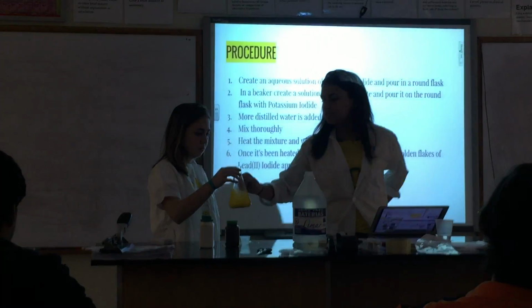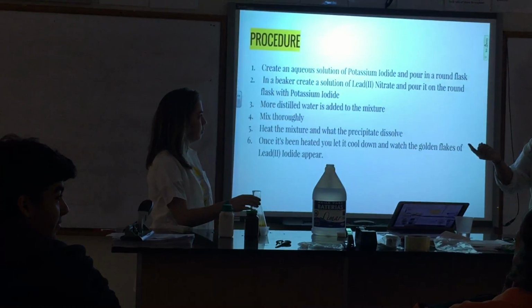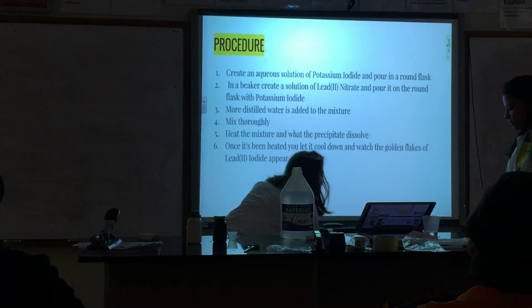Okay, once you have this, it says that you need to heat the mixture and wait for the precipitate to dissolve. It's going to be heating down here because it cannot reach the table.